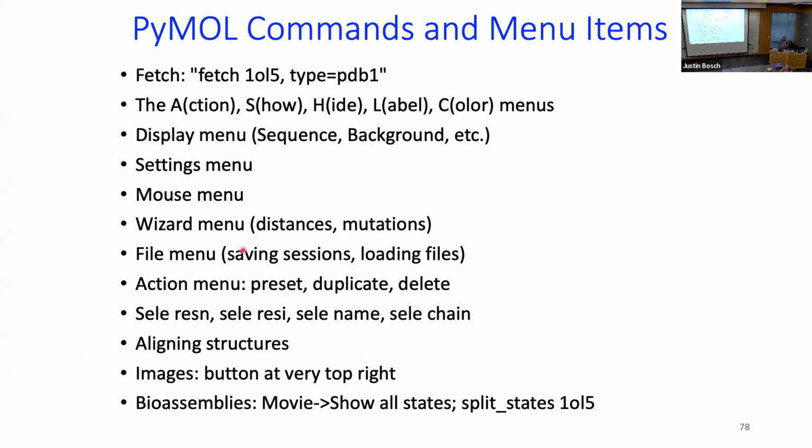Here's a list of all of those commands. I think I've told you most. You can save a PyMOL session. I haven't told you that. I did the selection stuff, aligning images. There's a button in the upper right where you can make a PNG image of exactly what you see on the screen. So it's super. Okay.